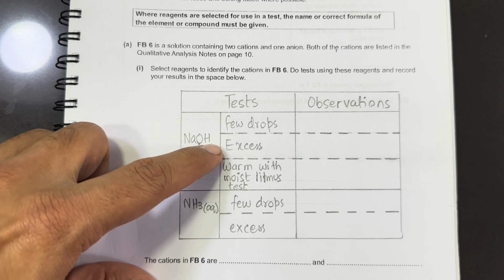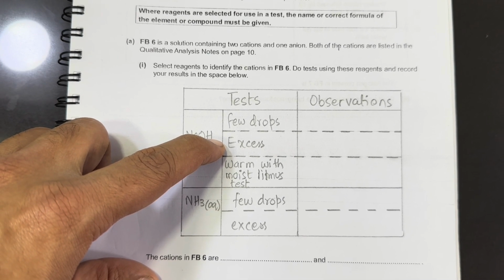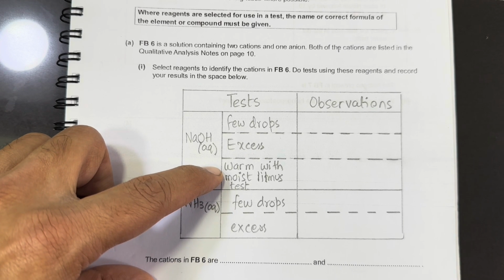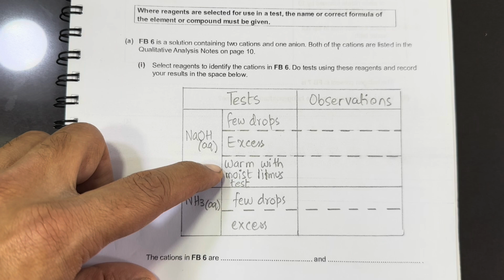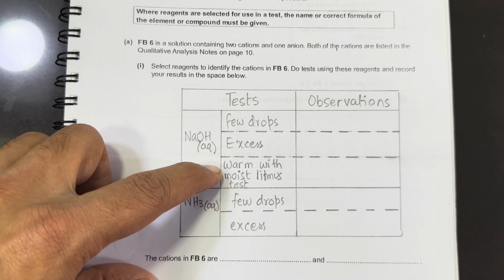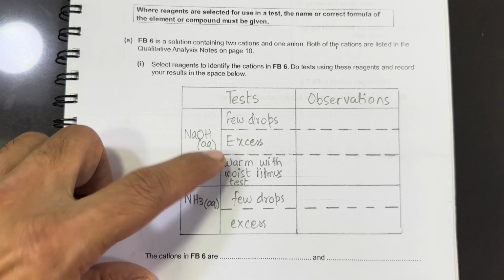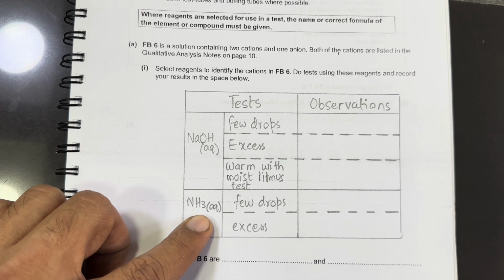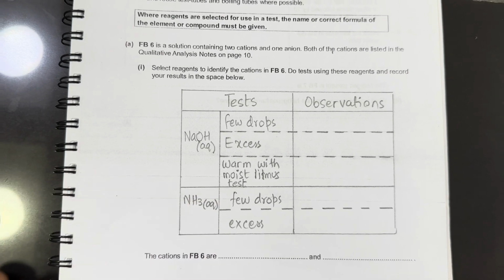First, we add a few drops, then we add excess sodium hydroxide, and then again we warm the same test tube contents and test any gas liberated with damp or moist red litmus paper, because it can give you the presence of ammonium ion also. And ammonia is the second reagent, where we add first a few drops and then excess. So let's perform this test.